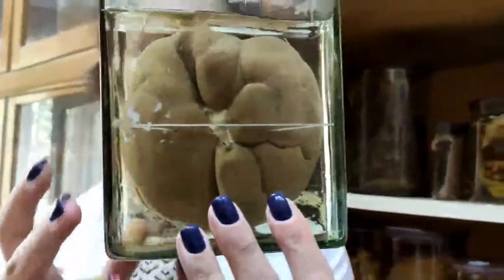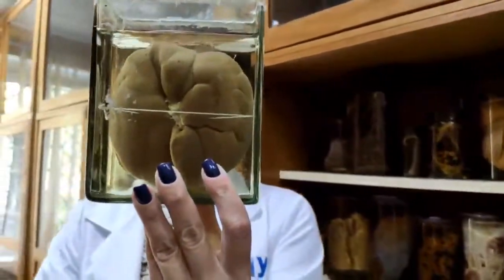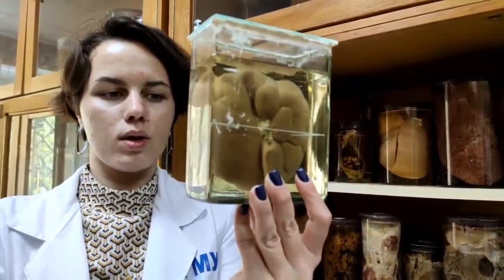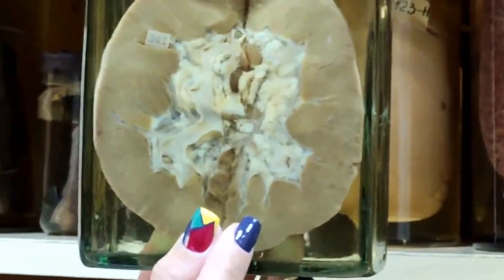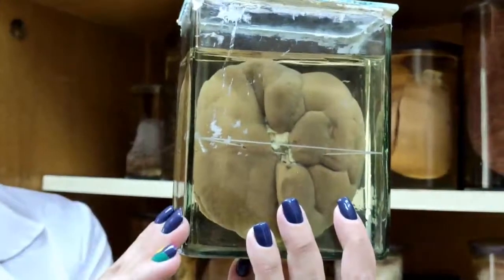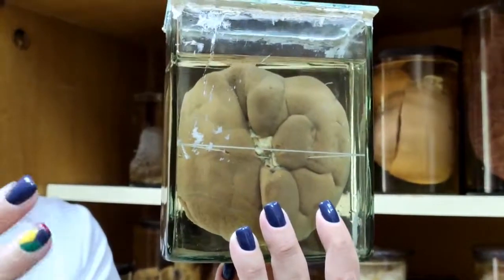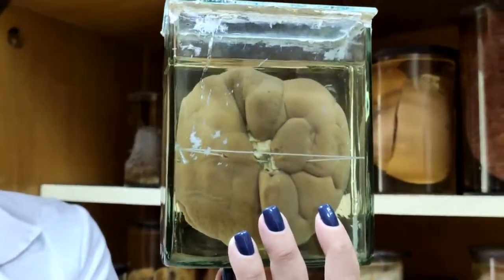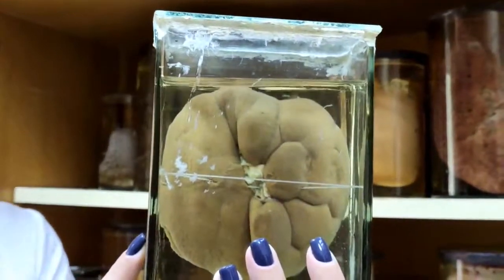So the first one is kidney amyloidosis. When you are talking about any pathological condition, you should first give the definition of what amyloidosis is. In this case, amyloidosis is a synthesis of abnormal protein. Amyloid is abnormal protein. As you can see, this kidney is enlarged and it has yellow or even white color. We can call it a big fat kidney or big white kidney because it's diffusely infiltrated by amyloid.